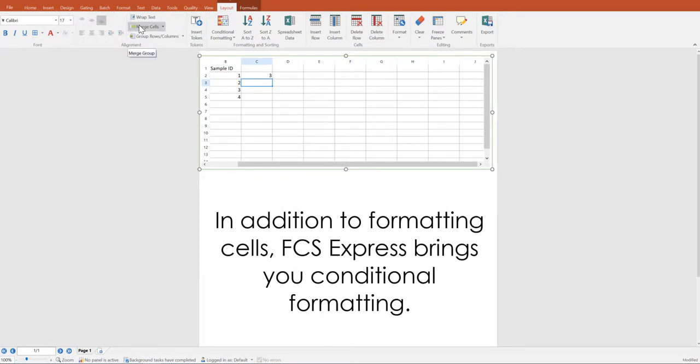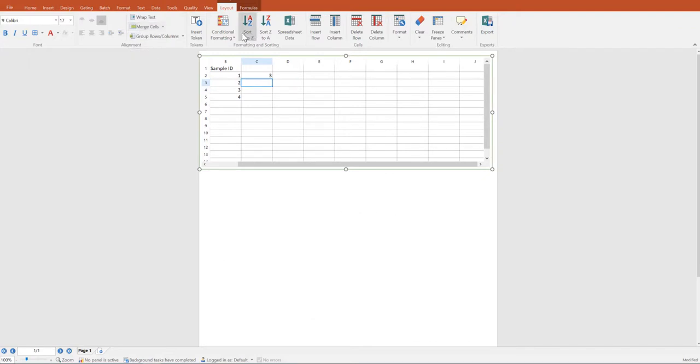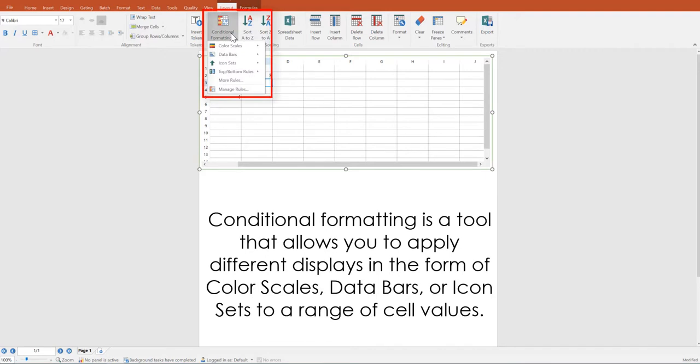In addition to formatting cells, FCS Express also brings you conditional formatting. Conditional formatting is a tool that allows you to apply different displays in the form of color scales, data bars, and icon sets to a range of cell values.